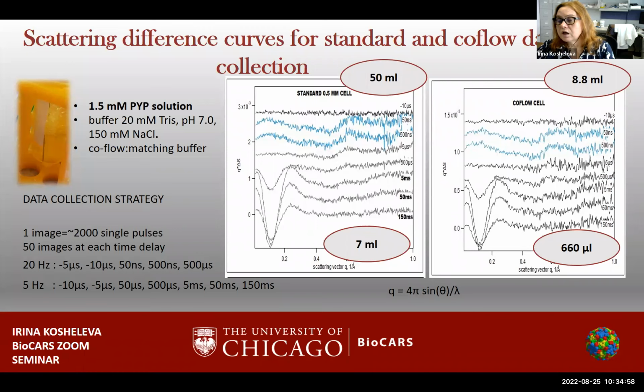I would like to say that this is a very big difference, and I think this cell can be performed very well, robustly, and can be used by other research groups to do their measurements, if they are doing measurements on a sample which undergoes an irreversible reaction.